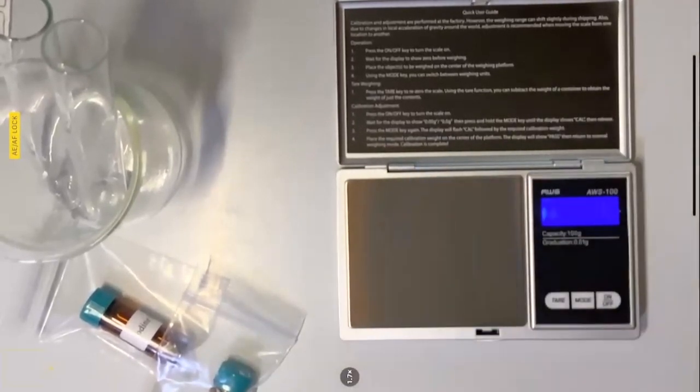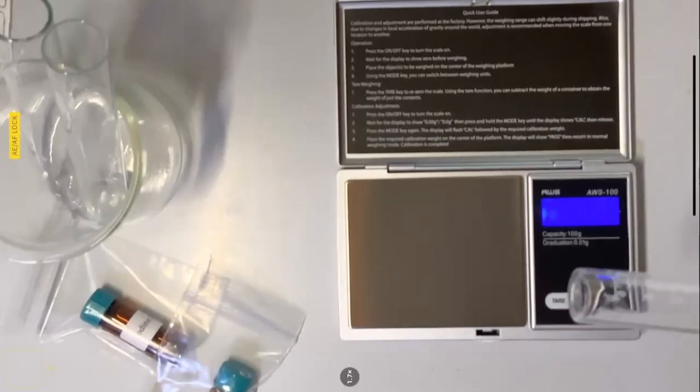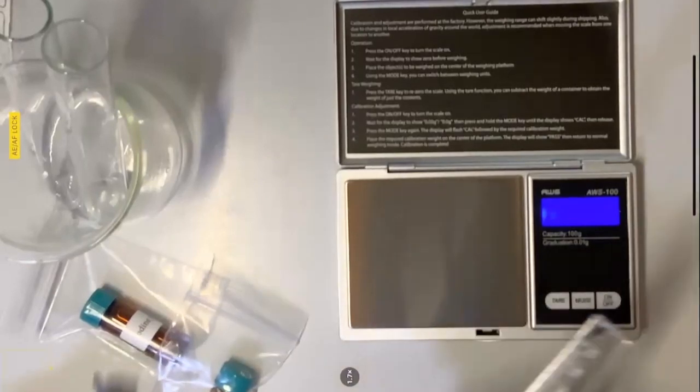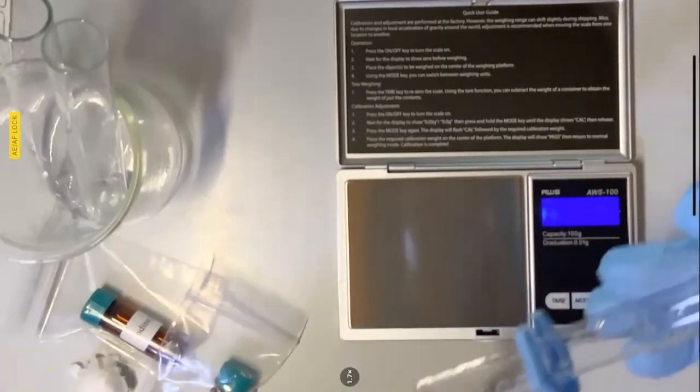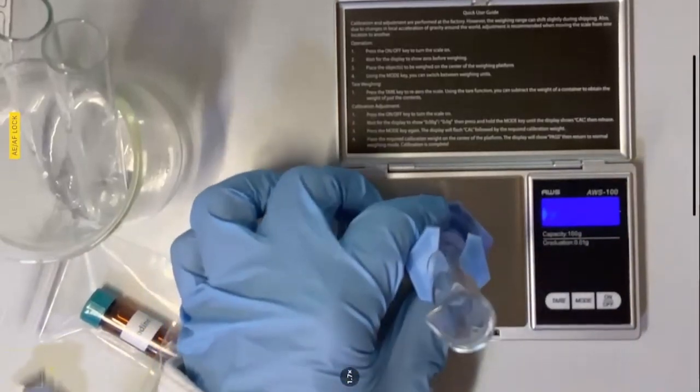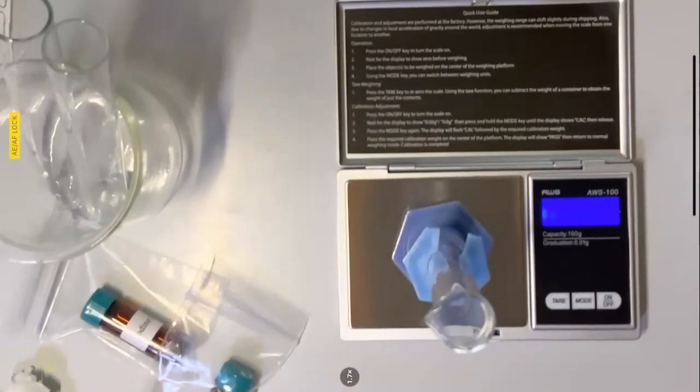Make sure there is no liquid in the bottom. And if you can see mine, there's still a liquid. You can't have that liquid. It's going to mess up your volume. So I didn't do a very good job, and that's because I'm trying to rush this. So I apologize. But again, make sure you get paper towel so you can reach all the way to the bottom. It needs to be completely dry. And I knew it wasn't dry because the mass for the second trial was different from the mass from the first trial, which means that there was a residual liquid. Anyway, you get the idea. You can't make that mistake.